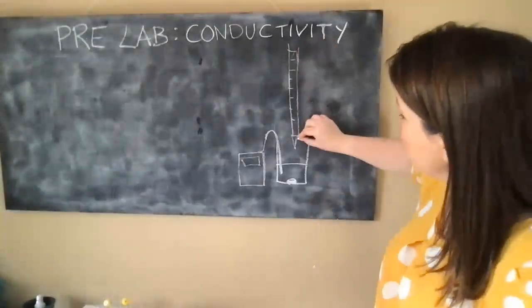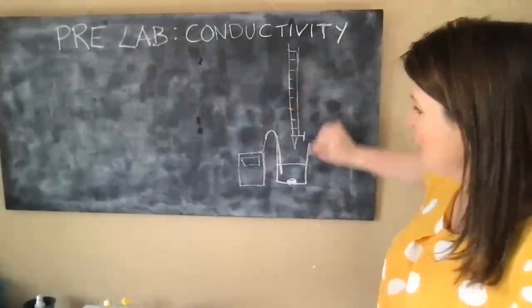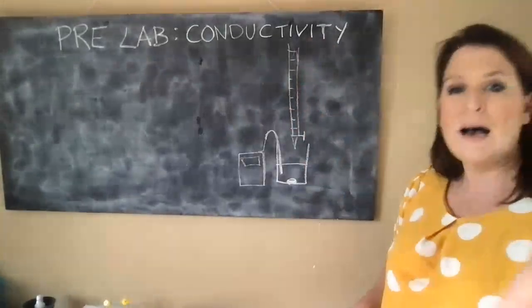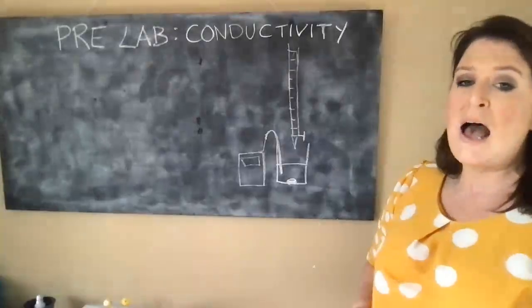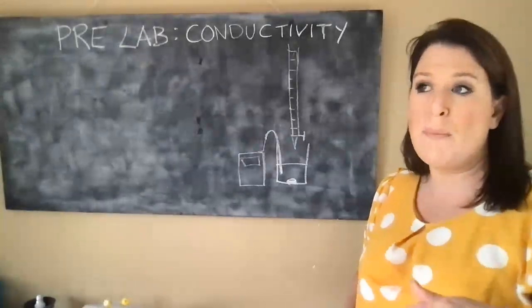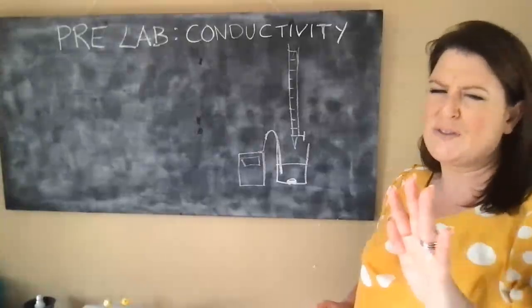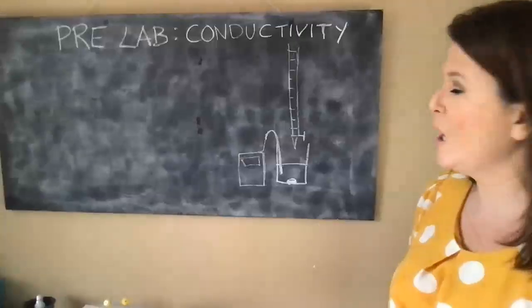So as we do this, you just add a mL, take a reading, add a mL, take a reading, add a mL, take a reading, and we're going to see a shift in the conductivity. We'll see hopefully the conductivity starting to drop, and then it will start to rise again. It's an unusual concept, but we'll see all about it in the pre-lab talk, and I'll explain it to you later on.